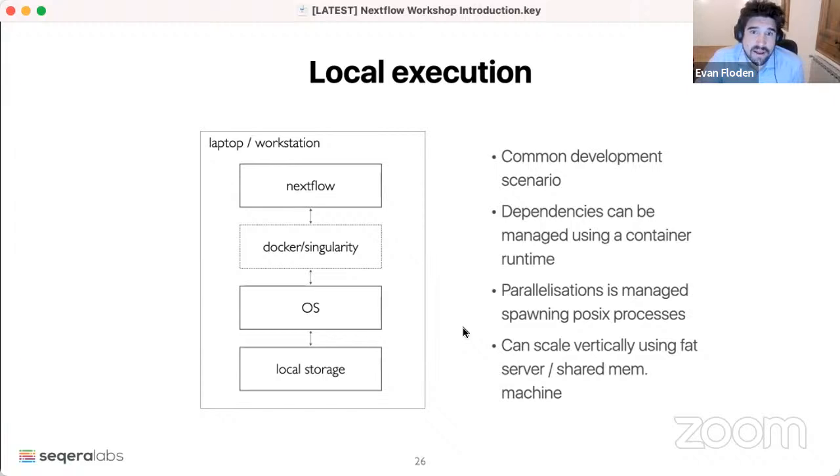This is most common for development, but also if you're just running a big box, like a single virtual machine that you just want to run everything on, you lack a little bit of the ability there. You get this fine-grained control of the individual tasks, though, because in situations with different resources or a very large pipeline, you can end up waiting a long time.